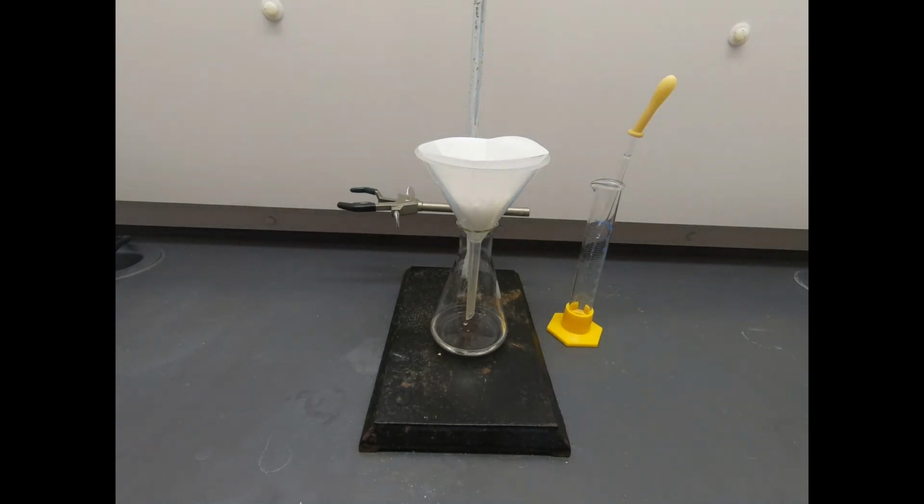I'm stopping because I feel like I've done a little bit of rinse and the bulk of any left behind material has now been collected. And if we miss a little bit, that's fine, because hopefully we'll recover even more because we use less isopropanol in this stage. So I'm not doing this with certainty. I'm just making my best guess. It's good enough to carry us on. So we'll let this drip through and then we'll tackle our precipitation step.